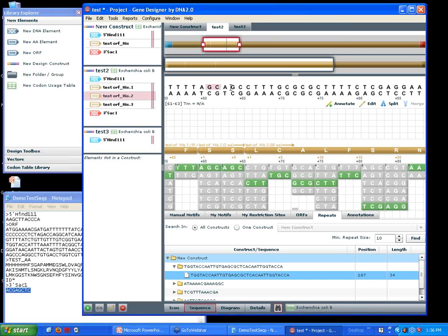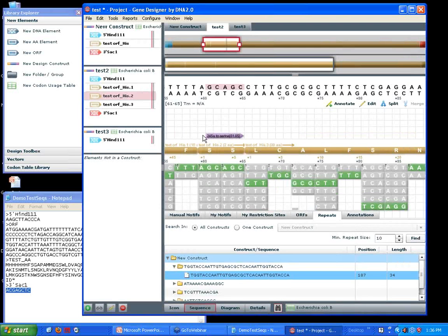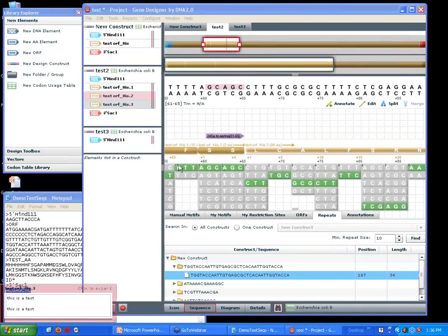And I want to annotate this so I know what I've done here. So I say serine. Can give it the position 245, alanine to serine. So you see the annotation right here. And now that I'm done with this, I want to merge this back.